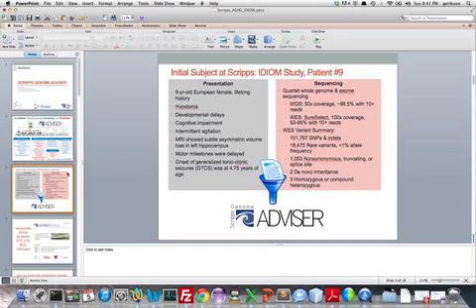For the whole exome sequencing variant summary, we have over 101,000 SNPs and indels, 18,475 are rare variants with allele frequency less than 1%, 1,053 non-synonymous, truncating, or splice site variants, 2 de novo inheritance variants, and 3 homozygous or compound heterozygous variants.